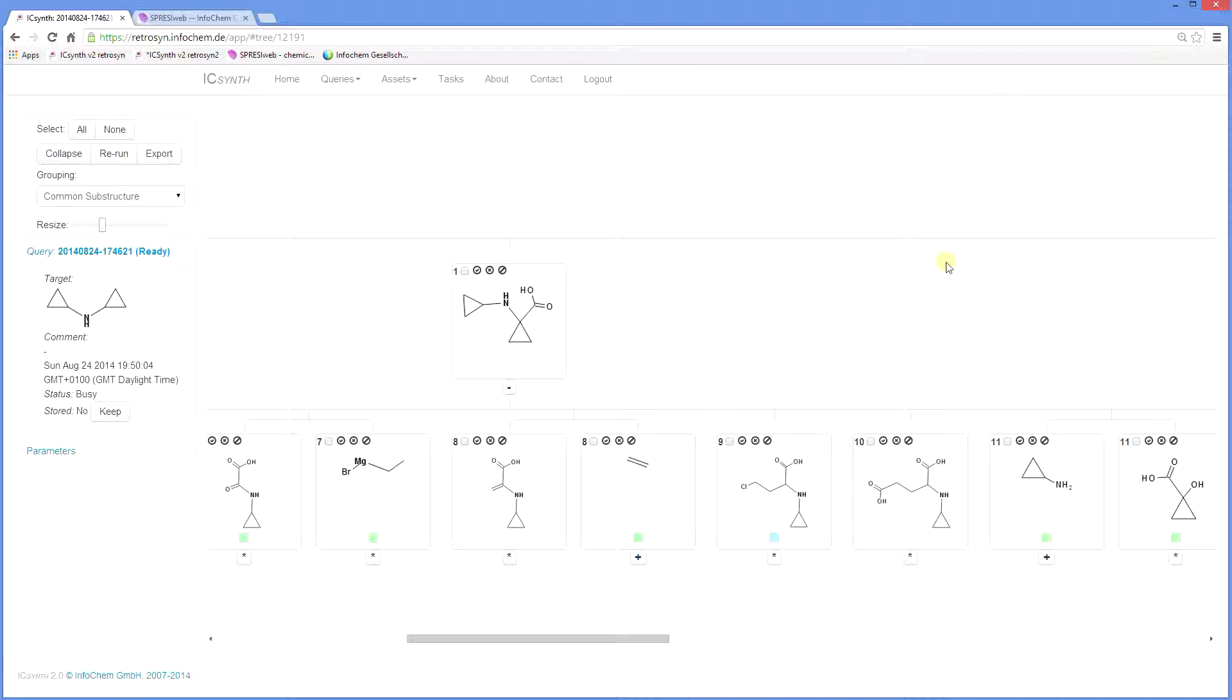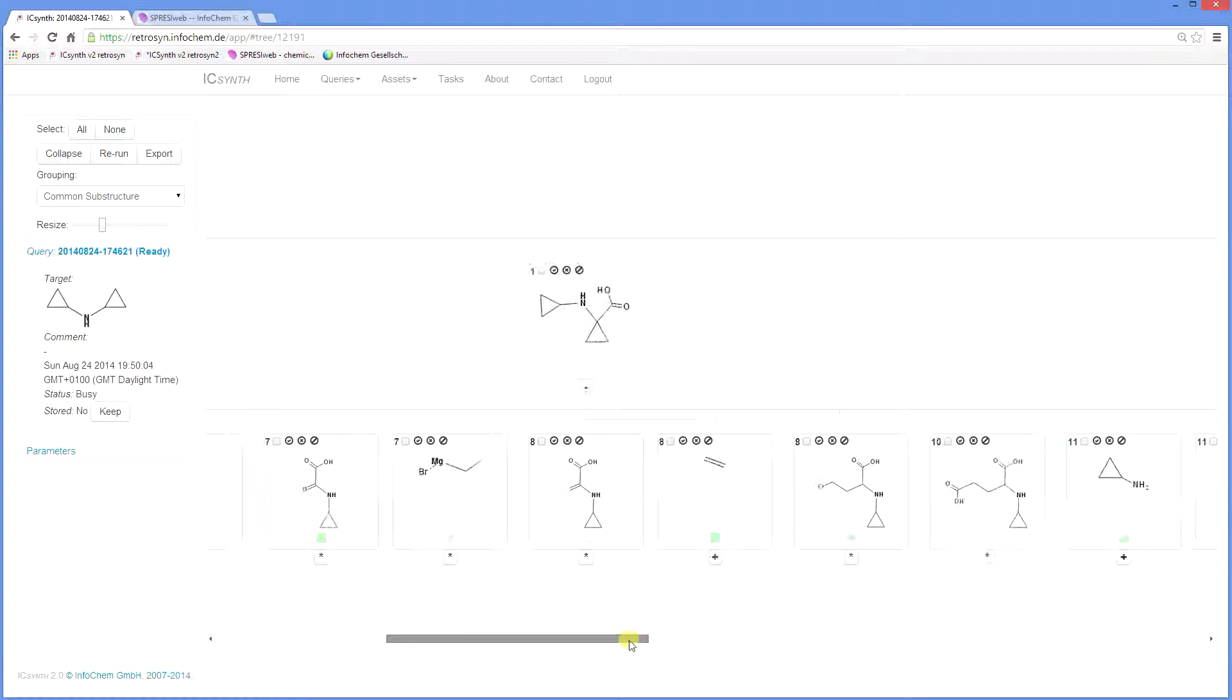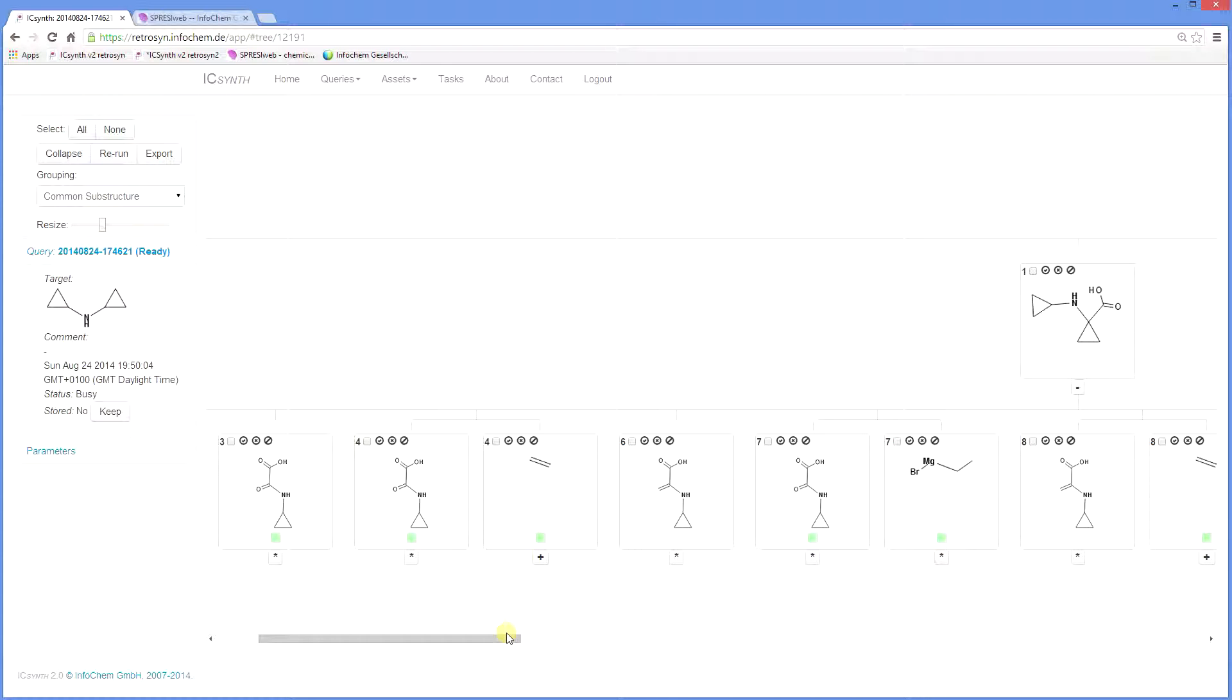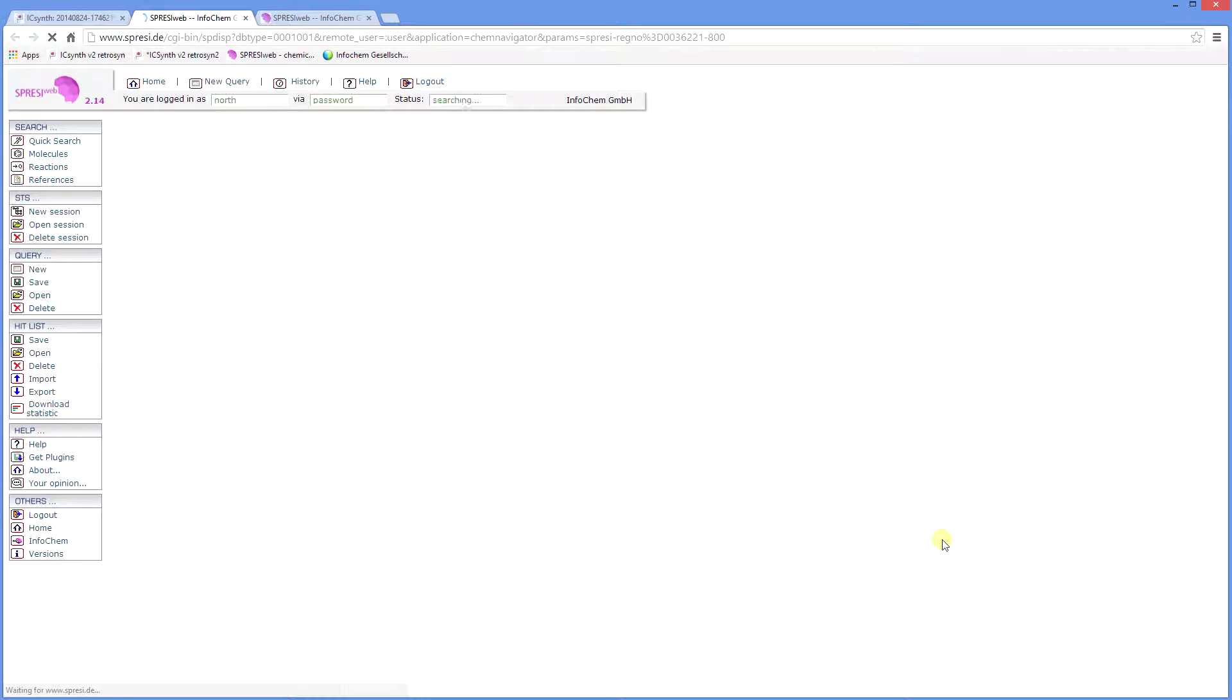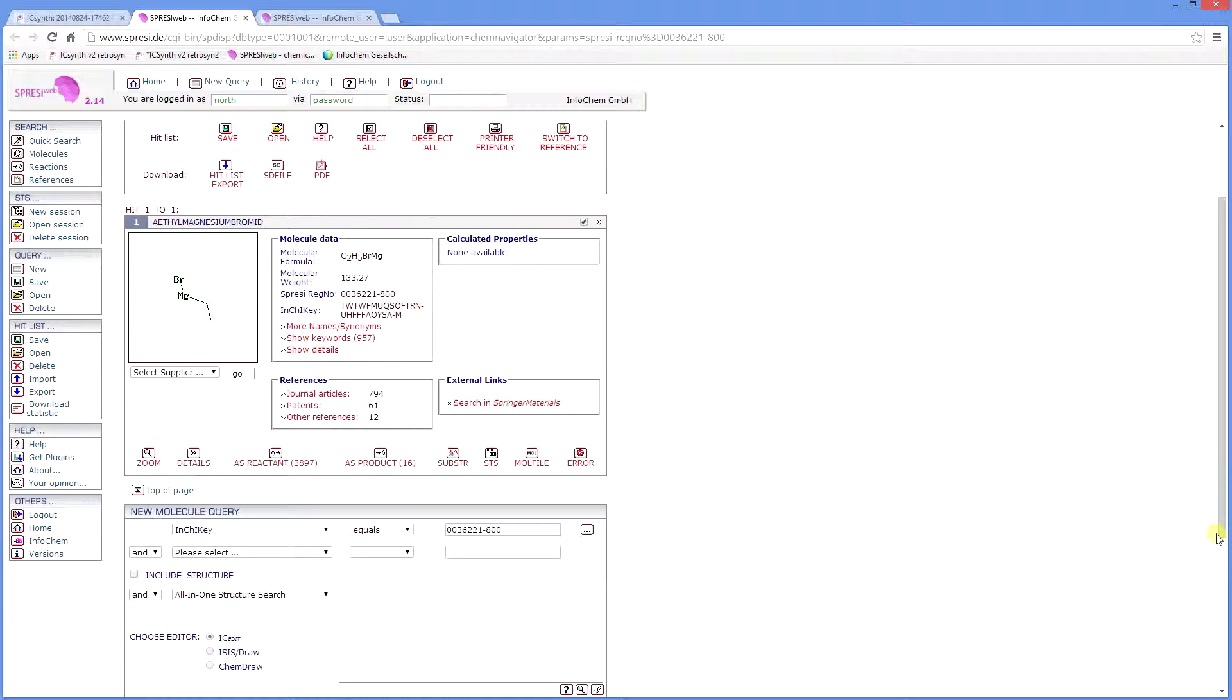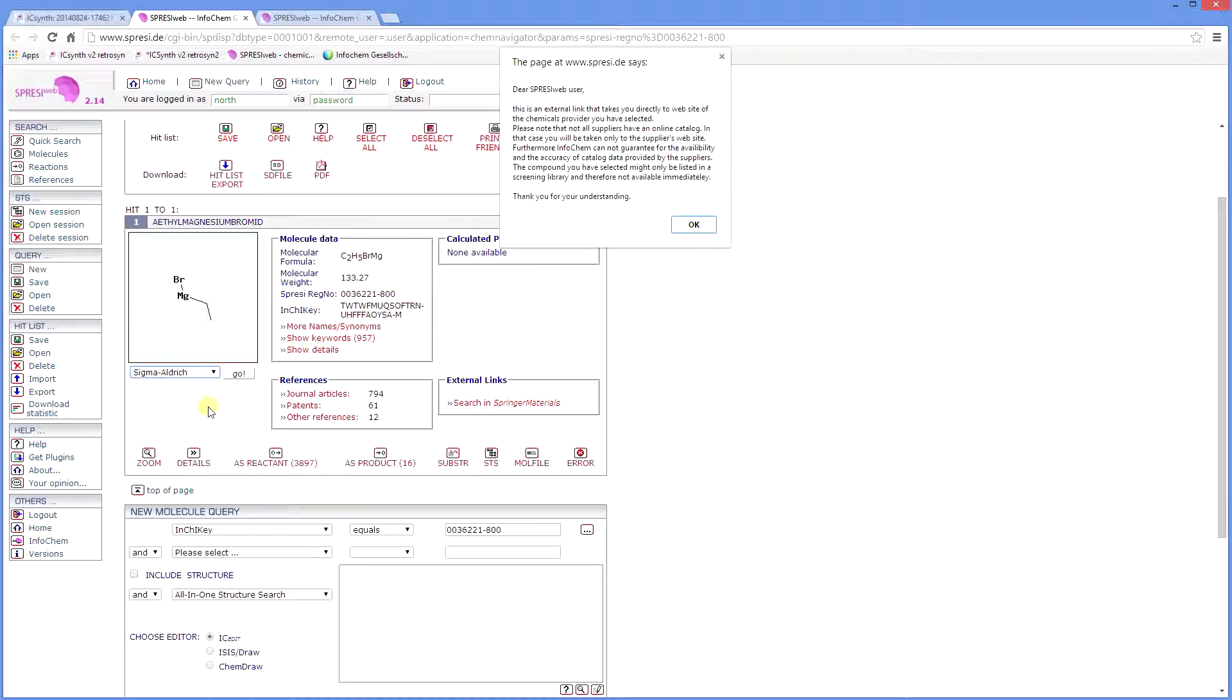The green square indicates that the compound is commercially available, for example, ethyl magnesium bromide. Clicking here will take you to the Spresi page, where details of the commercial supplier can be found under the Supplier drop-down menu. Choose a supplier and link to its homepage to purchase the compound directly.